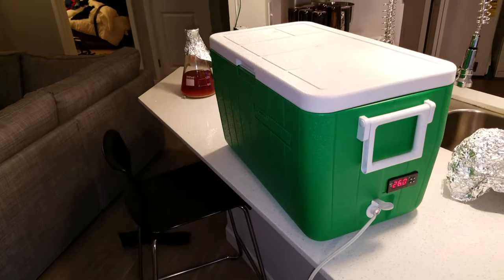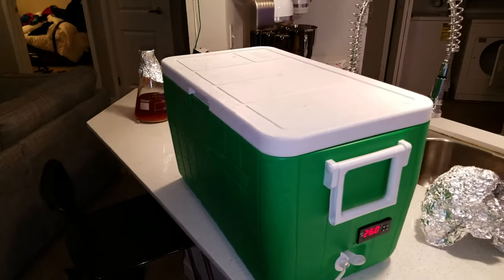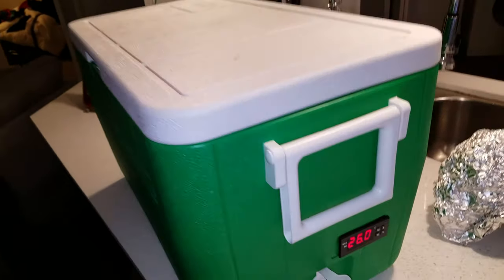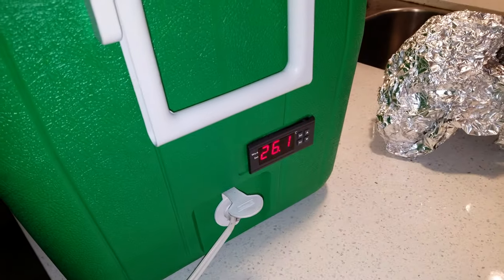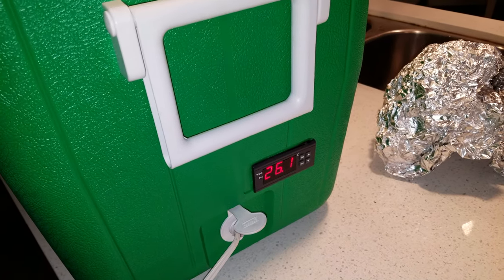So here is basically what I've done. You just take a cooler like this one, and you need to buy on top of that a temperature controller. This one is called the STC-1000, and it's very cheap and easy to wire up.